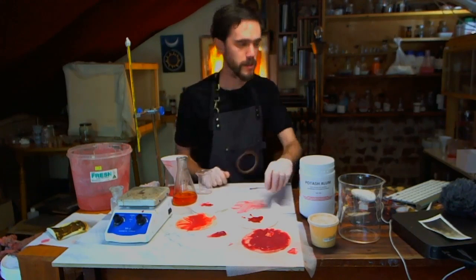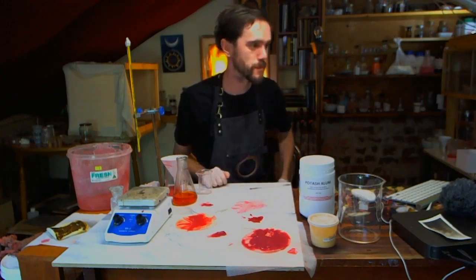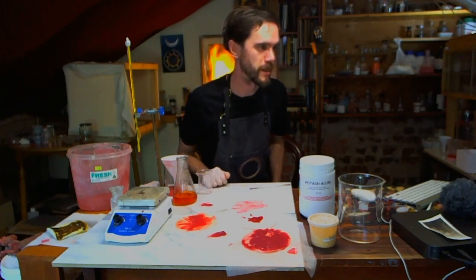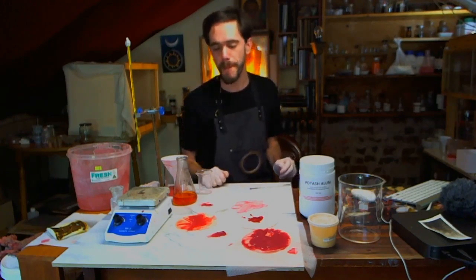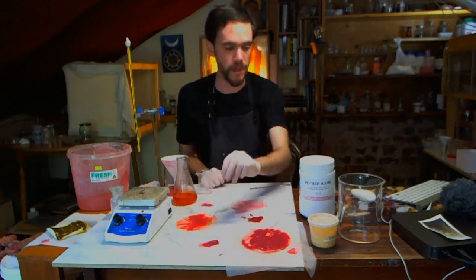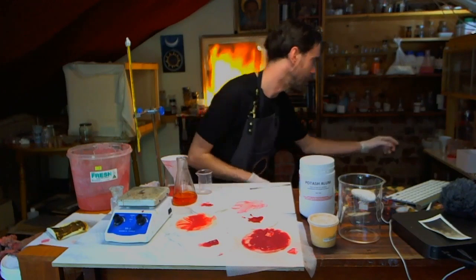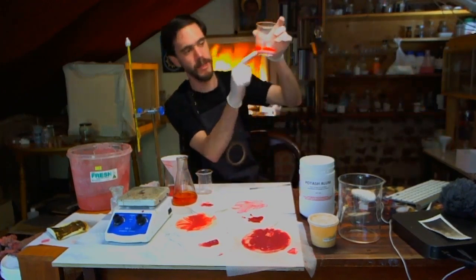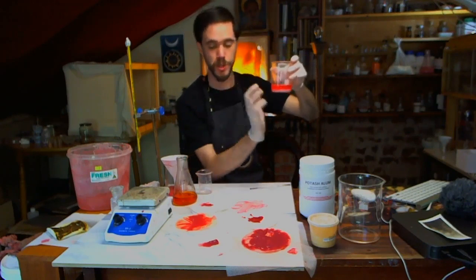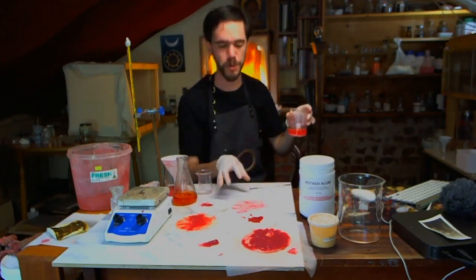But perhaps the lead may make the product dry quicker if used for making oil paints. Again, there should be no lead left in the pigment here. All the lead should have ended up here. That should be where all the lead ended up. So there should be none of the lead in the actual pigment.